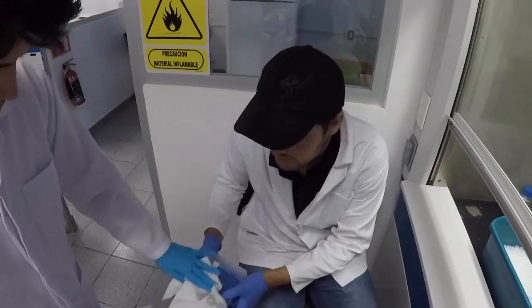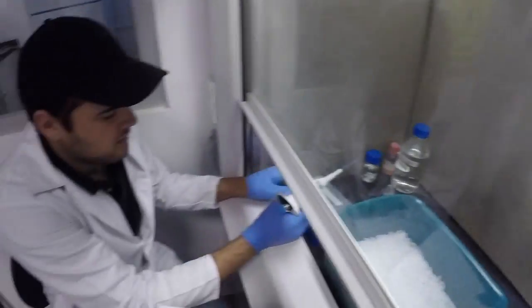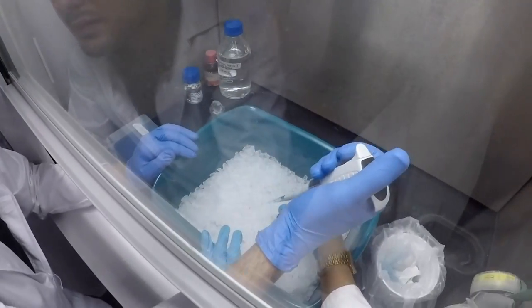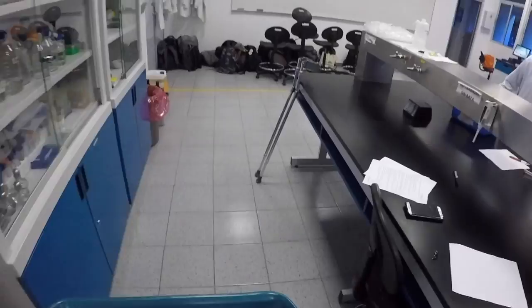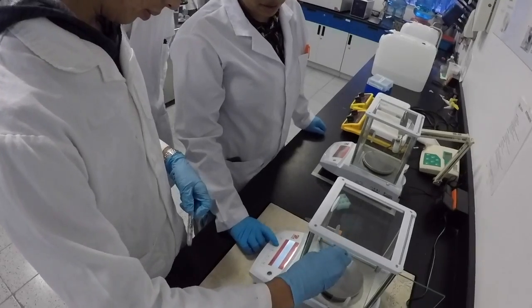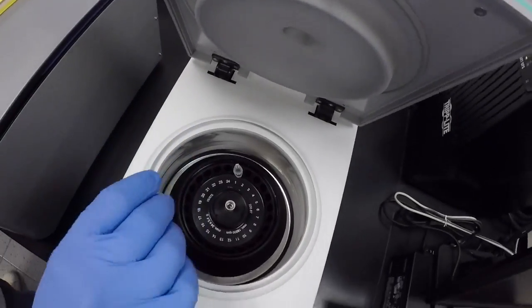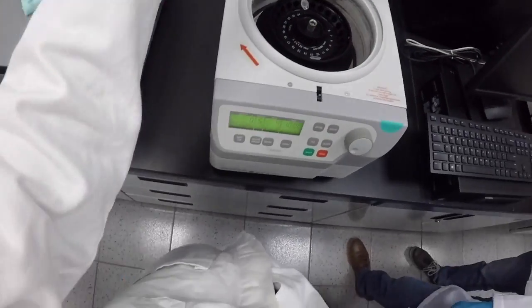Continuing with the practical, the sample was transferred to ice and put inside the laminar flow hood. Then, 500 microliters of chloroform in the isoamyl alcohol solution were pipetted in, and then they were mixed well by inversion. In this part, the second centrifugation took place, repeating the same temperature, time, and speed characteristics.